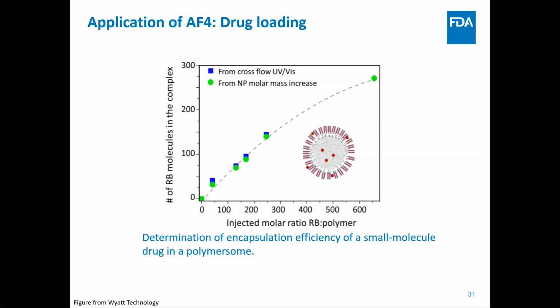Here is a very simple example showing the encapsulation efficiency of a polymeric particle carrier. As you can see, there's very good agreement between the amount that passed through the membrane and the amount that stays with the drug carrier.